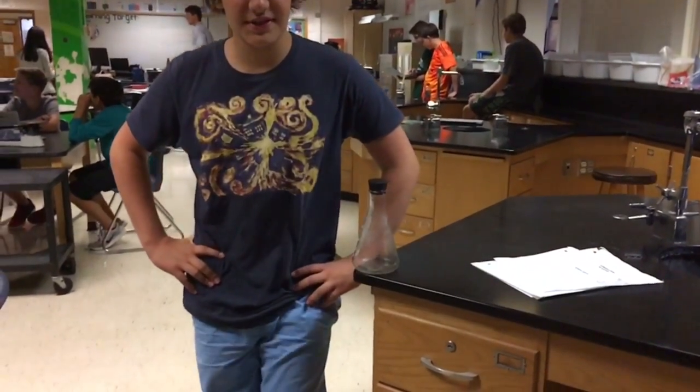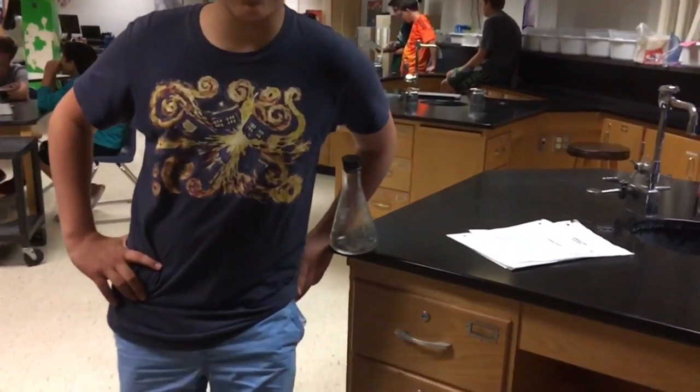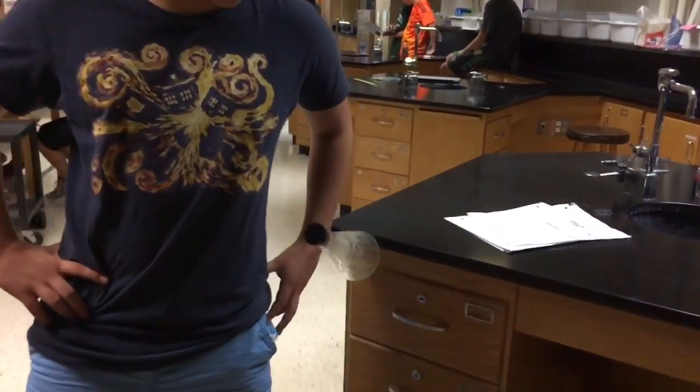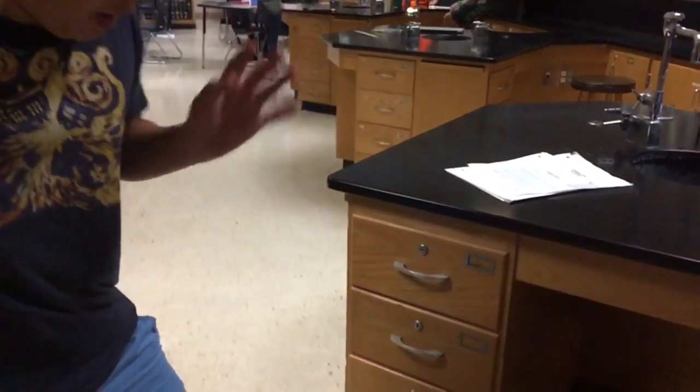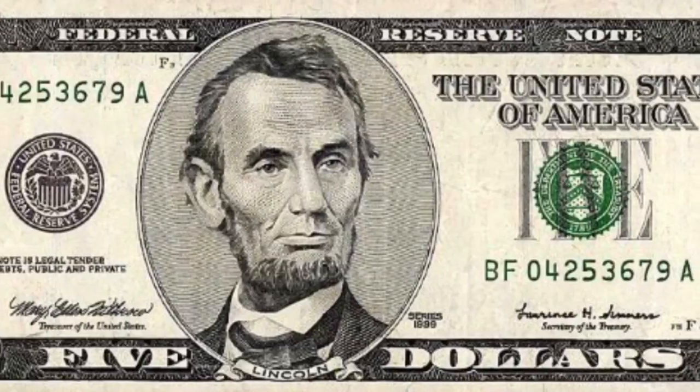Beakers and flasks are both glass and are easily broken by bumping or dropping. Don't leave yours next to the edge or else this could happen. Happen to break a beaker or flask, immediately tell your teacher. Replacement cost is $5.